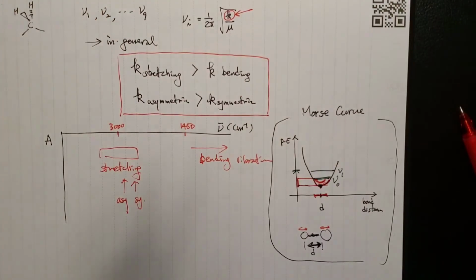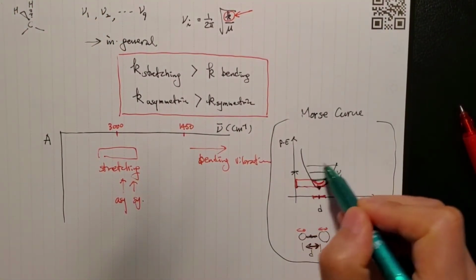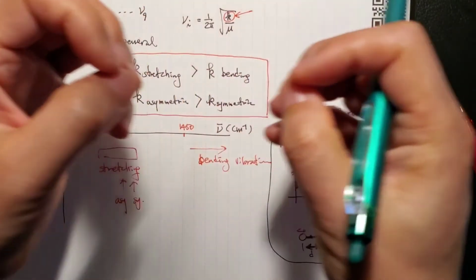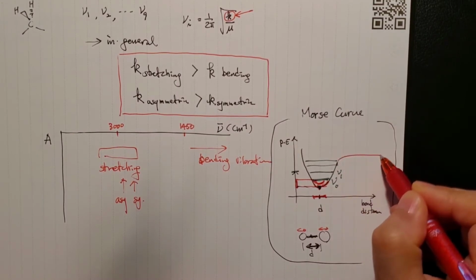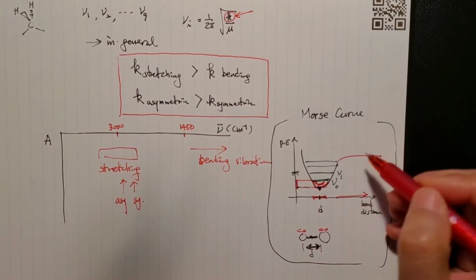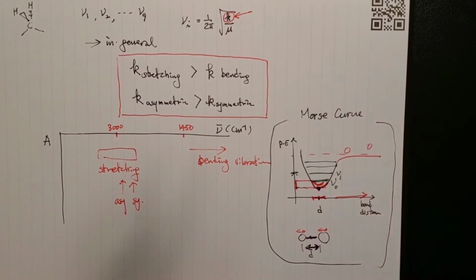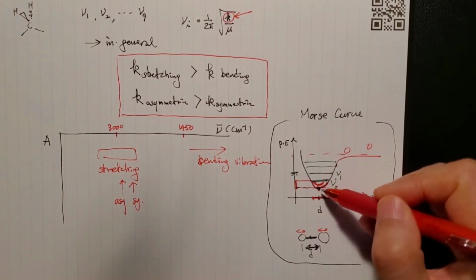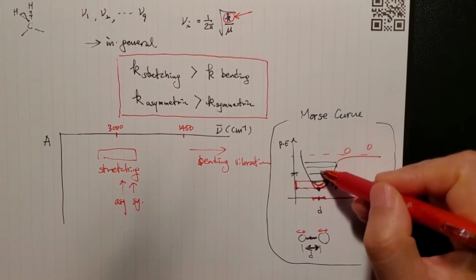If you keep giving more energy, that allows a quantum jump, right? Some moment you have too much stretching going on, so it's going to break apart. The distance increases infinitely, but the potential energy stays the same because they're not bound anymore. So they are free from each other. Bond is broken. That's when you have heat, I'm sorry, heat put into the molecule.